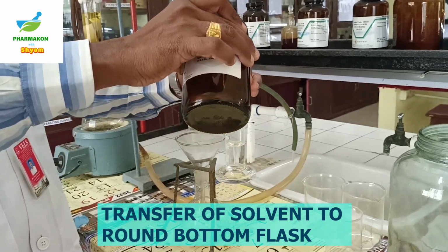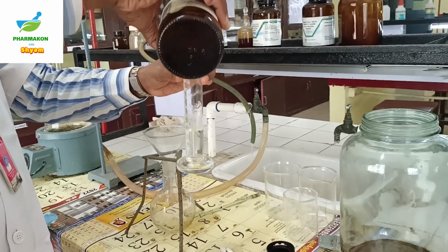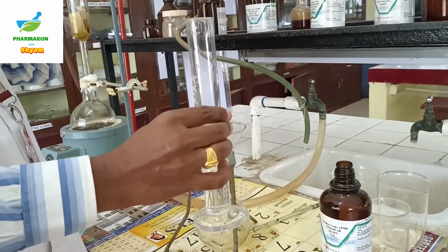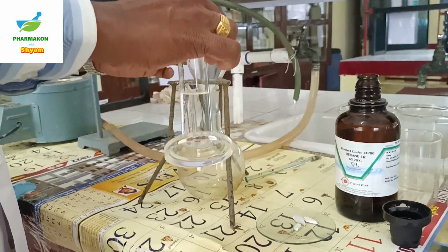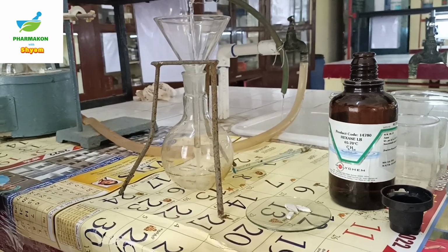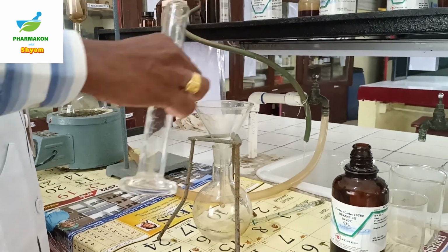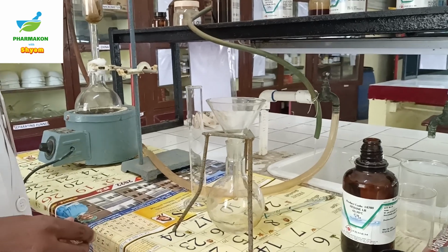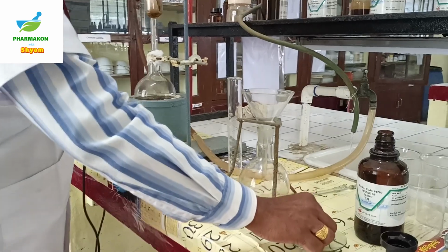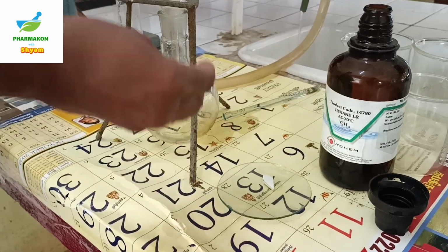Step 1. Take the required quantity of the solvent and transfer it into a measuring cylinder. Transfer the solvent into a round bottom flask using a funnel. When the round bottom flask is kept in the heating mantle, it will boil. To avoid bumping, add a few pieces of porcelain tiles.